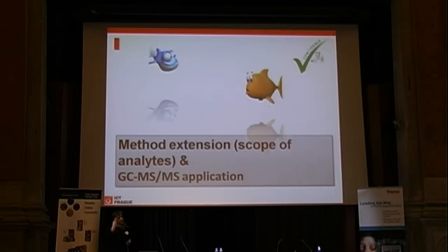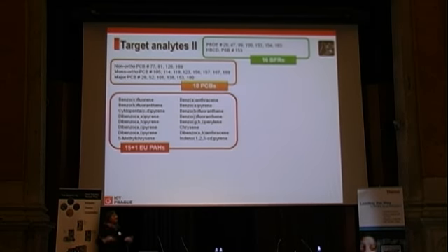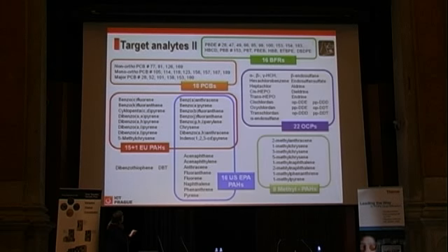When I say expand the method, you can see that in the next step, at the end of the project, we expanded the scope by many compounds. In addition to the small group of PBDEs and other compounds, we added, for example, for PAHs, not only EU PAHs but also EPA PAHs. We also added, and it was a big effort, within the AOAC validation study which we took part in, some alkylated species on request of AOAC, and we also put emerging brominated compounds on the list. So now the sample preparation method which I introduced is this one.